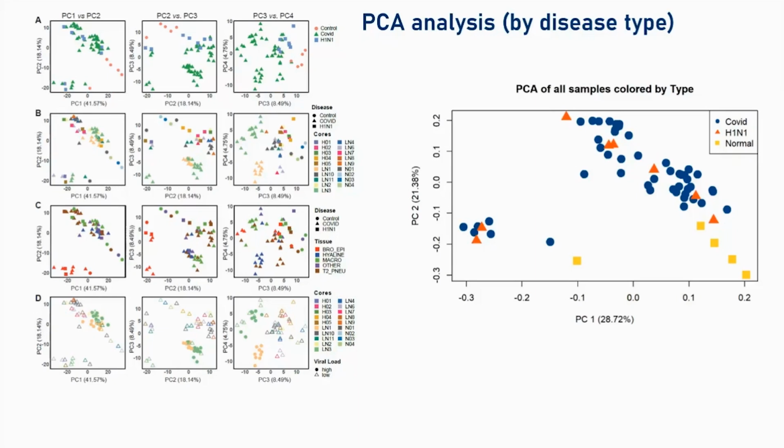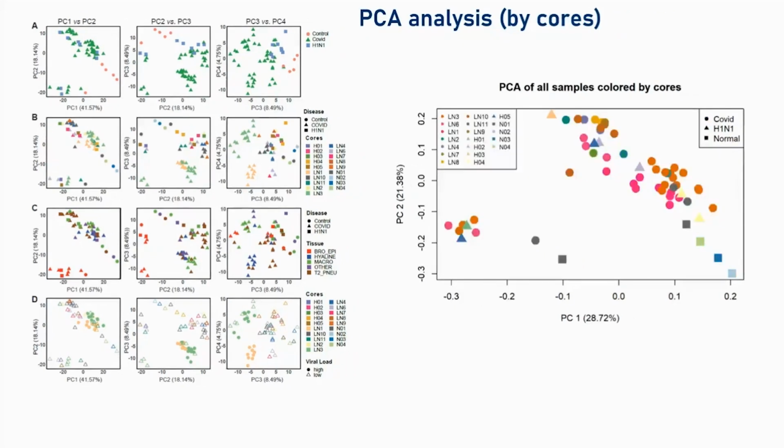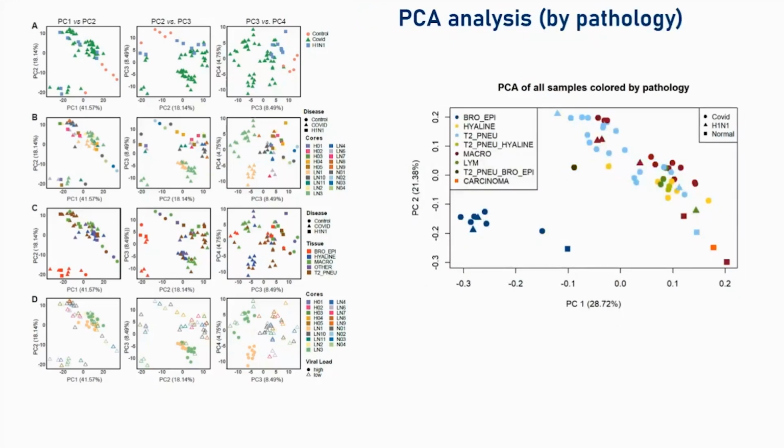And so what we tried to now do was to add in the cell type annotation for this data set. So this is not coloring it by individual patient samples here, where an individual color represents an individual patient. Again, you can't really get much insights into this. Where it got interesting for us is when we overlaid the pathology annotation for the majority cell type within each region of interest over the tissues, over the transcript data. That's when we could see the separation of the signal.